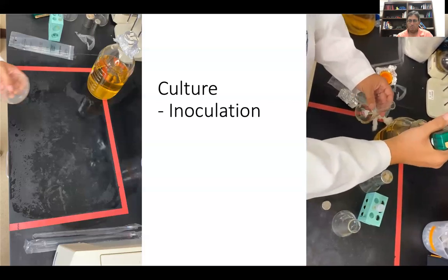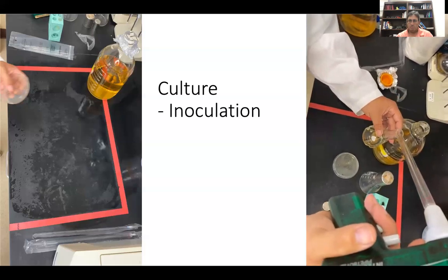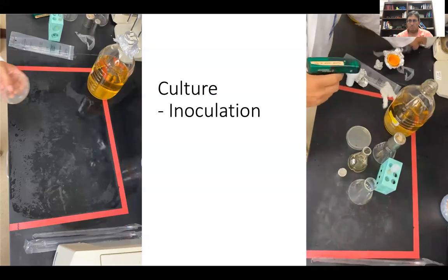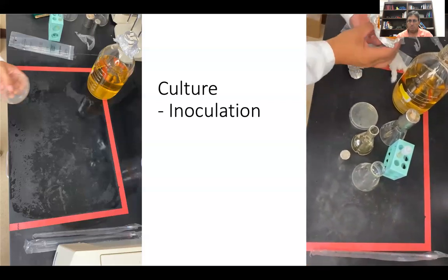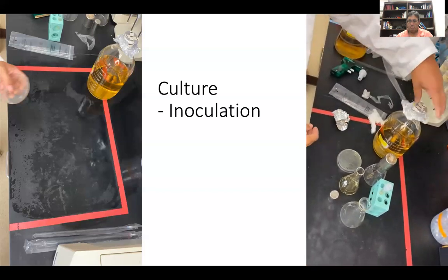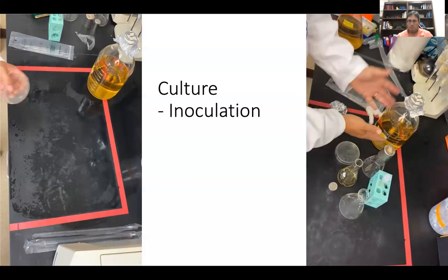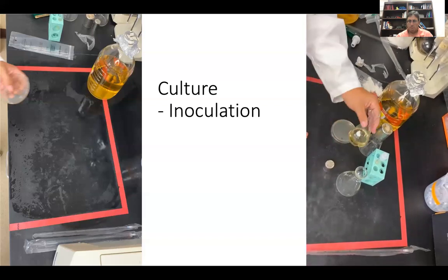Again, we're just seeding. Keep your fingers off the cap and the tin foil so it remains as sterile as possible. If we're not in a sterile environment, the kanamycin helps. All right, so I've transferred 50 mils into this vial.